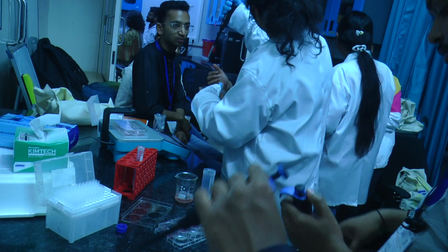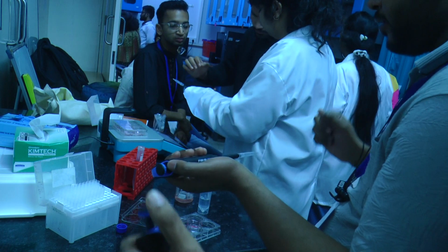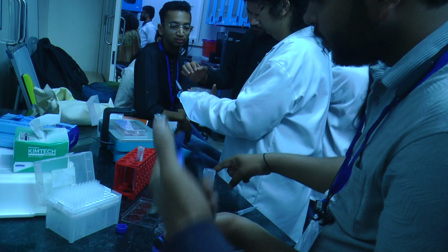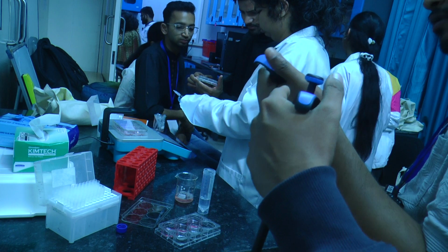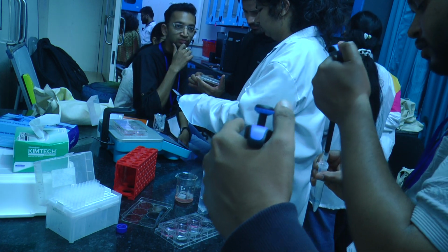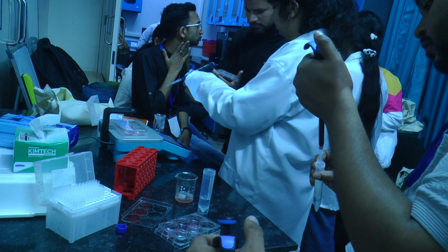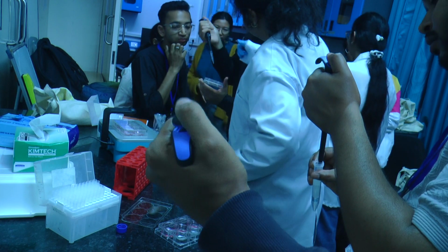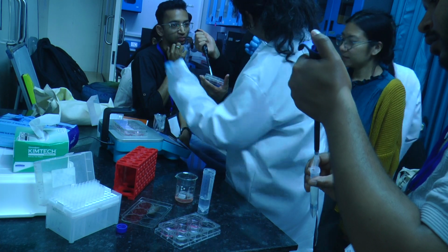And there is another buffer, the cellular one. I put a new tip on. No, no, if we use the same buffer we can use the tip multiple times unless we touch it. Now that one inside. So how much? I have set it at 500 microliters. Just press and take it, that's it. That's enough.